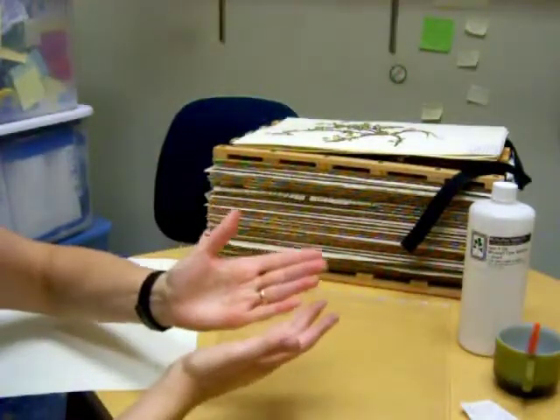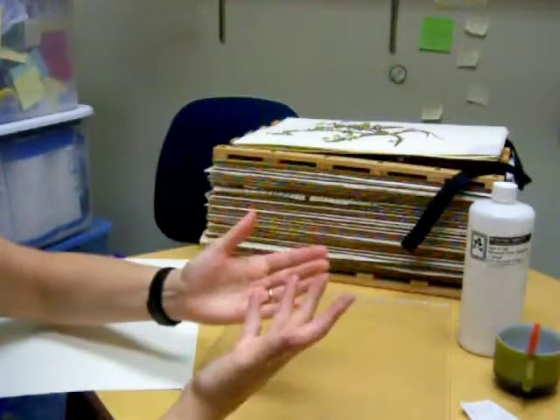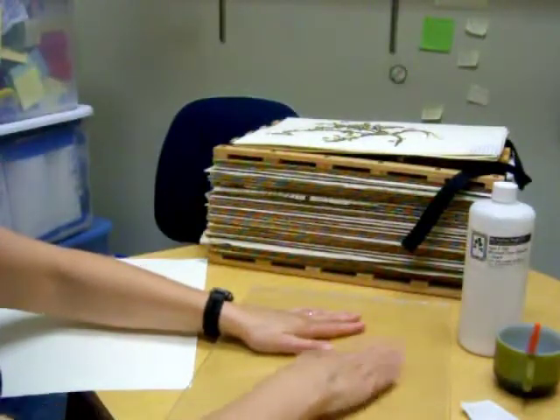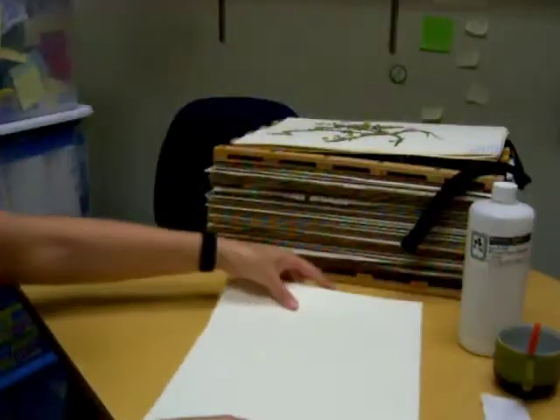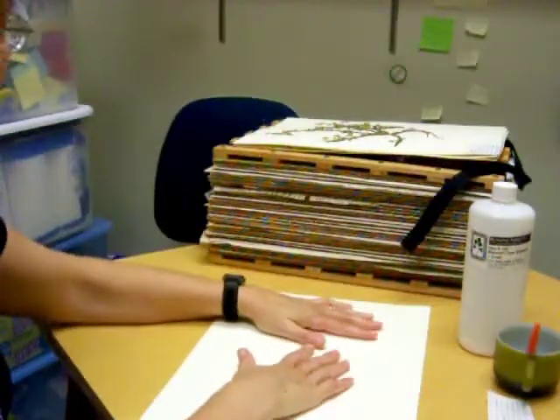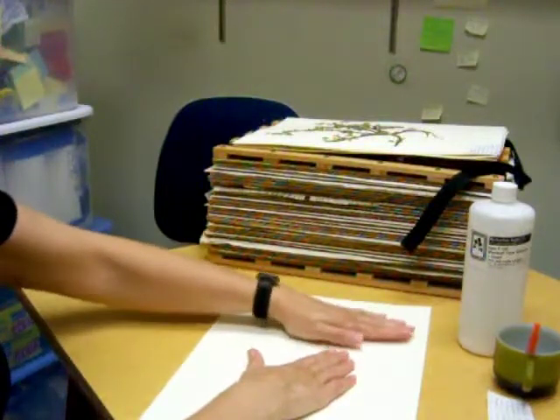Then I would carefully look at my specimen, make sure which side I wanted to glue and which side I wanted facing up on the sheet. Press it down in the glue and make sure I had glue everywhere. Then very carefully turn the glue side over and position it on the paper and press down very gently.